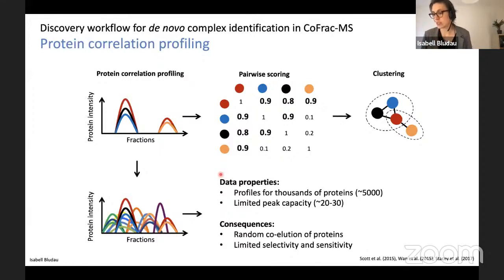So one question is, I would think that all your discovery and hypothesis-driven network analysis on protein-protein interactions will depend, and should be validated by other assay methods, on the type of buffers and, of course, the number of fractions used. Yes, this is definitely true. It generally depends a lot on what kind of fractionation strategy you use, what information you can get.